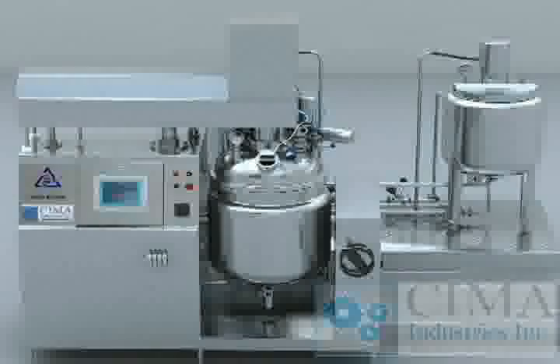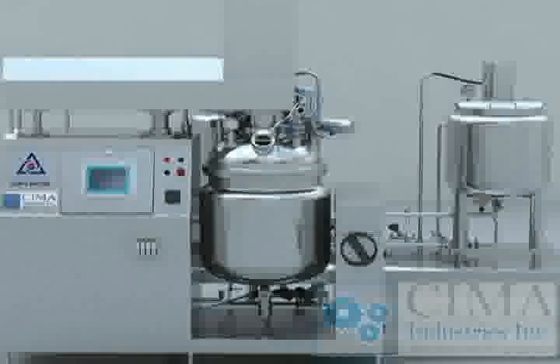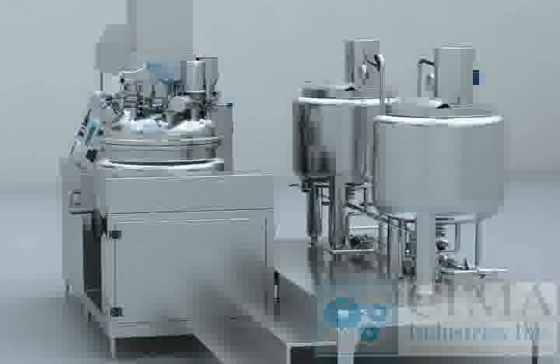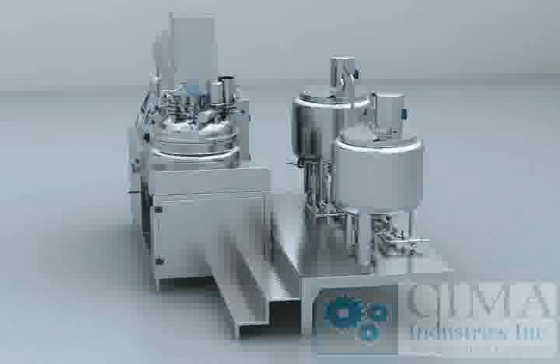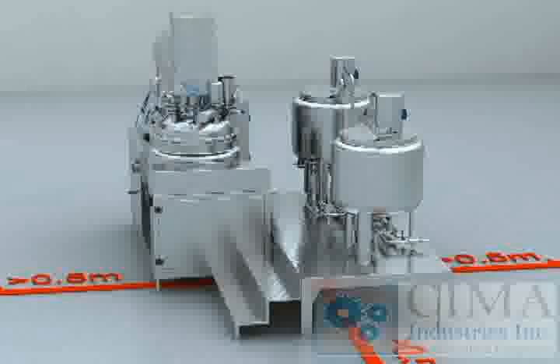Installation: Place six main machine pads after the main machine and working table enter the workshop, then put the main machine on the pads. Use a level bar to adjust the level of the main machine. Put the working table behind the main machine, place the stainless steel ladder beside the working table, with the sides aligned. Connect the stainless steel pipe and compressed air pipe between the main machine and working table, and the wiring between the main machine and preparation tank room. Also connect the steam pipe, water inlet pipe, water discharge pipe, condensed water discharge pipe, compressed air inlet pipe, and wiring to the emulsifier. The emulsifier should be kept at least 0.5 meters from the wall, preferably 1.0 meter, for maintenance and cleaning access.